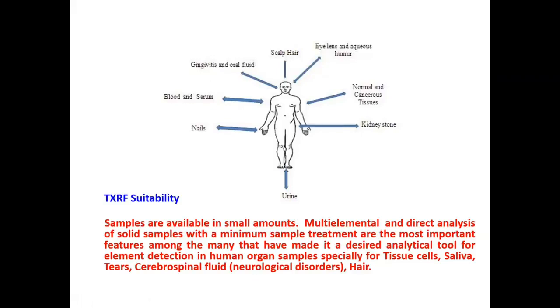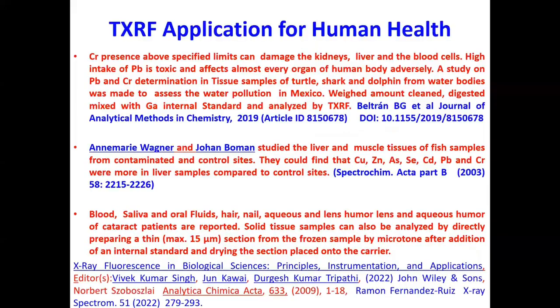Then TXRF can be applied for such analysis in a painless manner. If you draw blood, you get pain, but if you analyze the gingival fluid or oral fluid, then it can give information in a good manner. So some such analysis is reported in the literature. Just I tried to show, one analysis is just one minute.